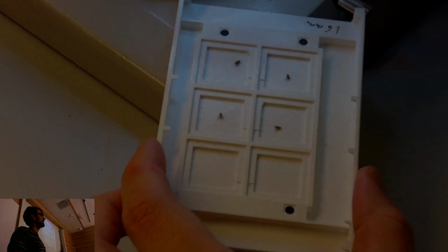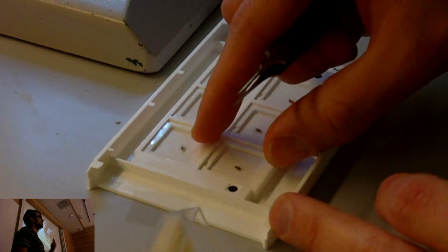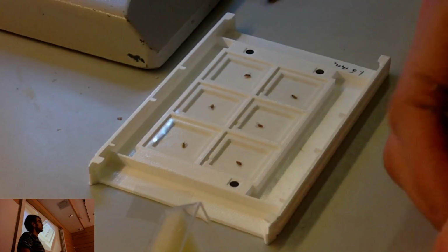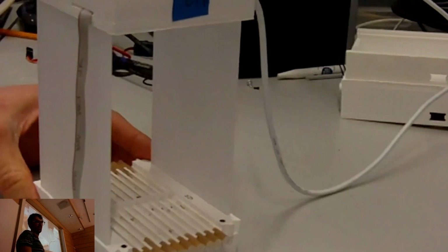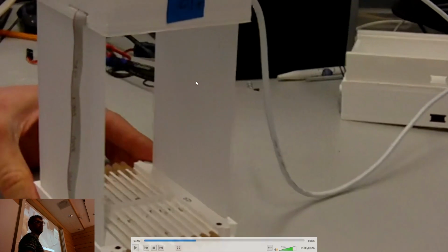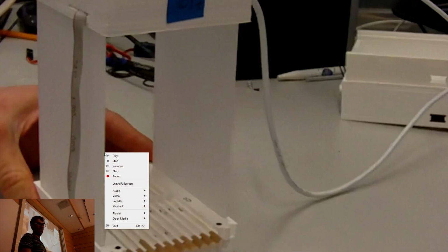Now we want to observe them for days and days, right? And they can live pretty well in those tubes for many days, and we want to take pictures consistently, like 2 times, 3 times per second, and assess whether they're moving or not, and if they're eating, if they're mating, and this sort of thing. So we designed a system where we can load the arena, and it has a camera on the top. So it combines some laser cutting to make the wall and 3D printing, and it has a Raspberry Pi and a camera and some infrared lighting, so we can see them in their subjective night, what they think is the night.